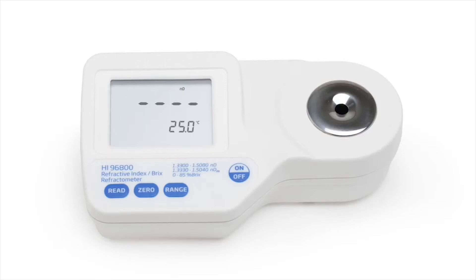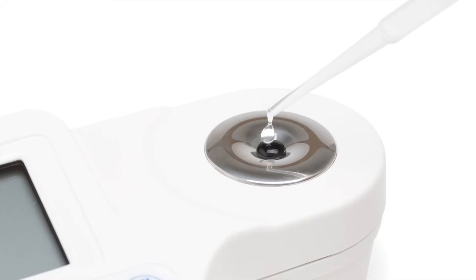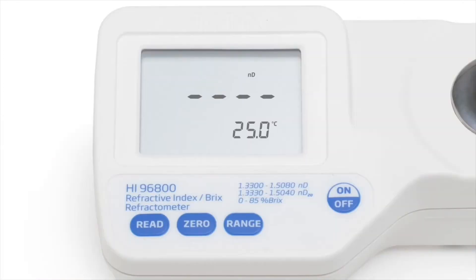Calibration of the meter is straightforward and only takes a few seconds. Using a pipette, a small amount of distilled or deionized water is placed on the sample well. The zero key is pressed, and then zero is displayed to indicate the meter is ready to perform a measurement.